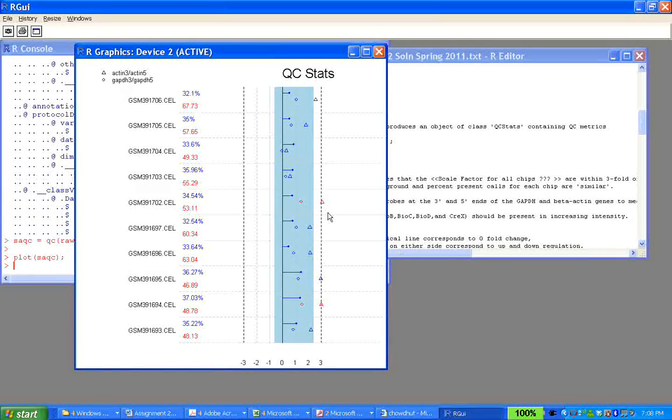As far as QC and its protocol is concerned, it depends how your particular lab sets them up. So in this scenario, these two deltas or triangles just marginally did not meet the criteria, so maybe you will have a procedure to say, I'm okay with this, I don't have to fail these cell files. But if this triangle was way over here, around 4-fold change, then you can probably say it failed one of my QC steps, so I'm not going to recognize this cell file as part of my analysis, so you can exclude it.